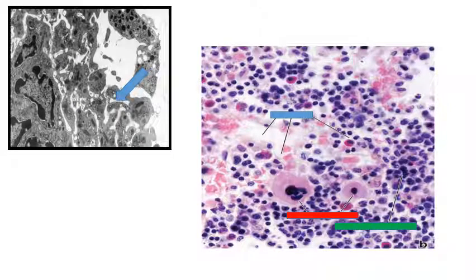Okay, so here we have our platelet demarcation channels right here. We've already discussed this in blood. I hope that you know it. It's very important. And we can tell that we have our big blood cells right here. So this is a megakaryocyte, that's a megakaryocyte, okay? And let's talk about some of these areas right here. We see red blood cells right here. If you look closely, you can see that they're kind of on top of one another, almost like a rouleau pattern. And that's probably because this has been stained and all sorts of stuff, so it's kind of violent when it was taken out. But you can see the sinusoid right here, big sinusoid. And again, we start to look right here, this would probably be a place where we're either having lymphopoiesis, granulopoiesis, or erythropoiesis.